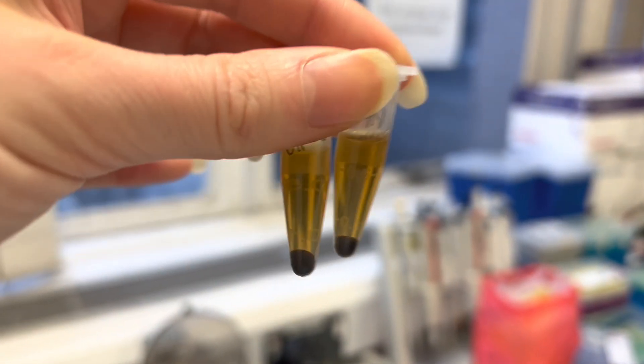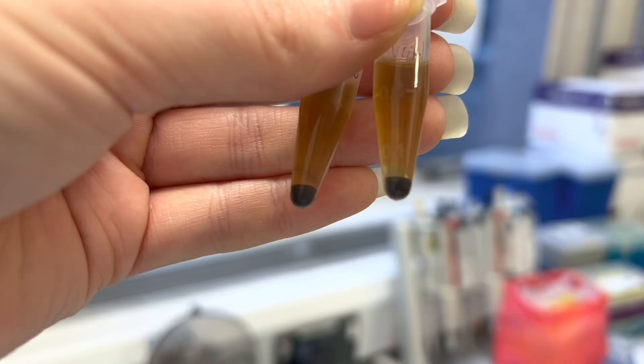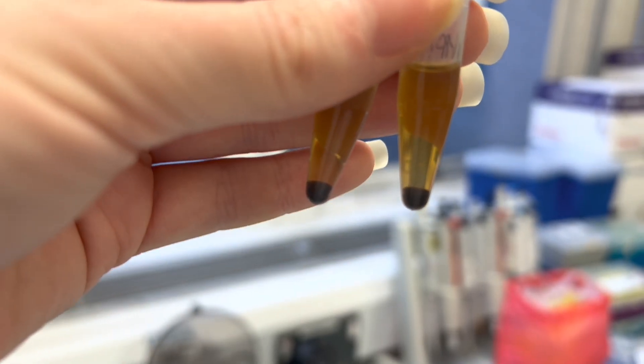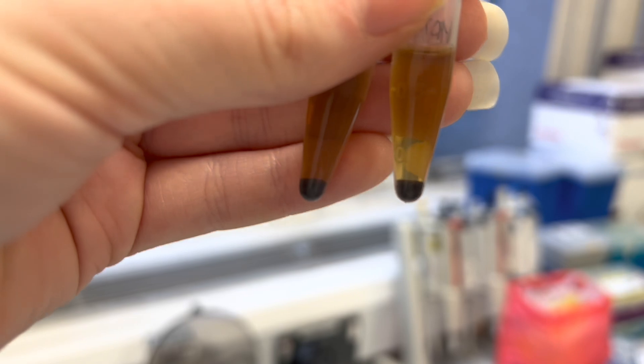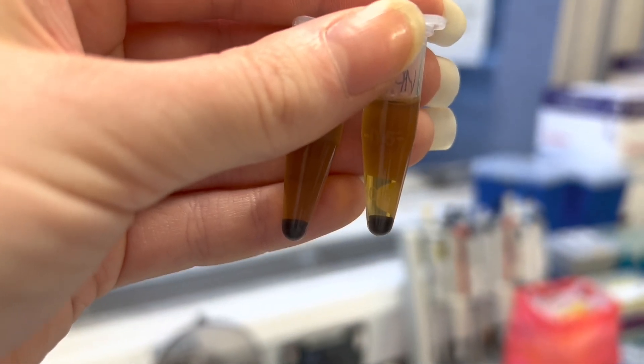I'm waiting for my sample to centrifuge and then I'm going to start running the HPLC. I dissolved the sample exactly how I wrote it in my notes, and as you can see after centrifuging, it's not soluble. So I don't know what happened. I'm going to need to dry it and then dissolve it again, so I'm going to be starting the HPLC way later than I wanted to.